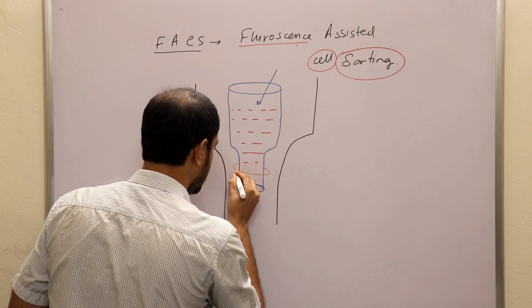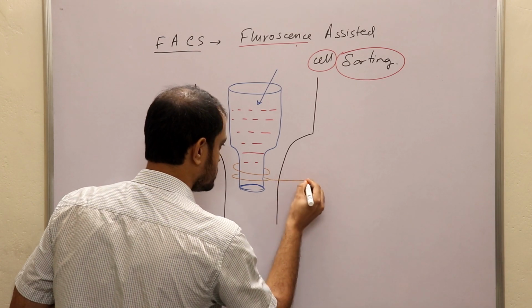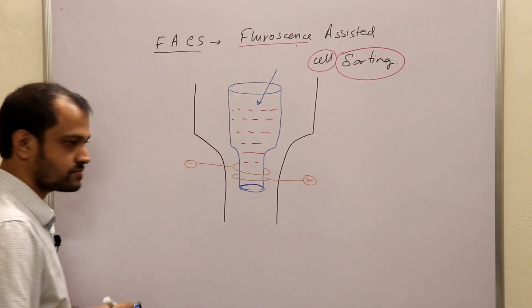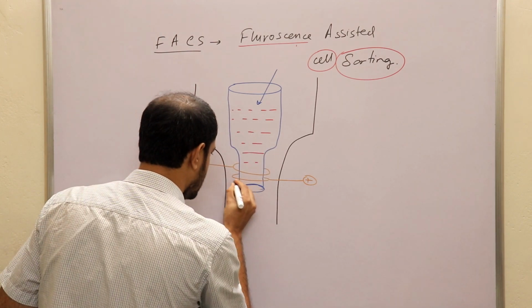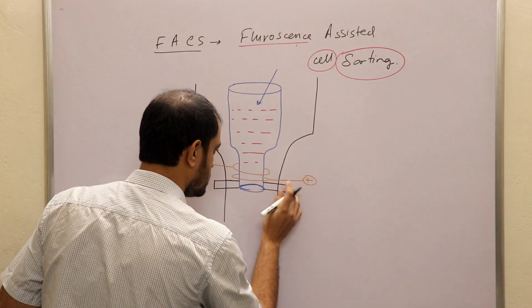That means I will be using a charged tube here, and another thing I will add here is a vibrator.